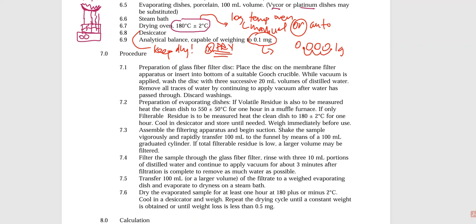So how much stuff is actually there? Is that contamination? Well, we can almost deem it as contamination if, in fact, it is supposed to be very clean water. But it might just be completely harmless, like NaCl or salt dissolved in water. Whatever the case, they're wanting the TDS number for a reason, and that's what we're providing. So TDS is what this is all about, total dissolved solids.